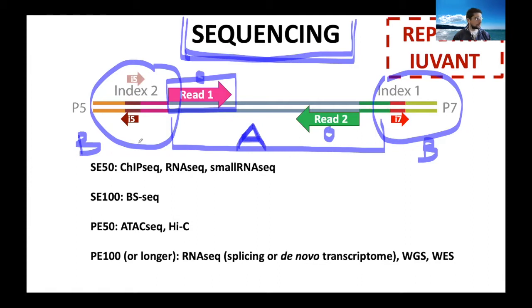Then what about your indices or barcodes? Okay, you can have a single index. Single index will sequence index 1, or I7, that is situated on the P7 adapter, and a dual index will sequence both index 1 and index 2, which is also called I5, which is in dark red here in the picture. Okay, I also have some examples here.